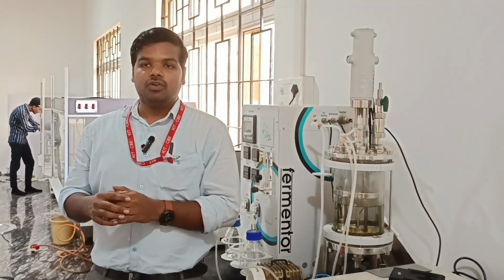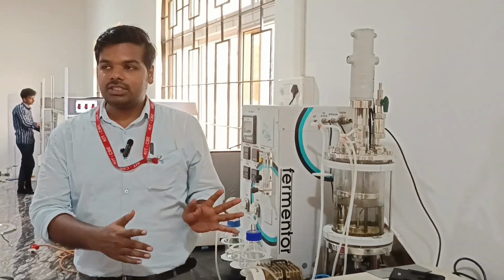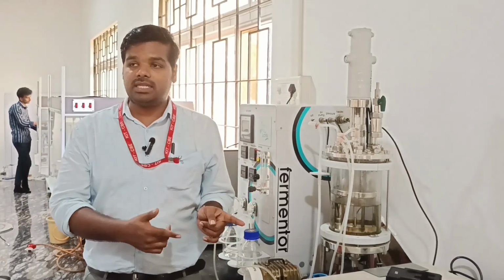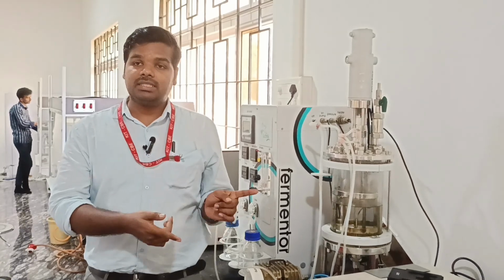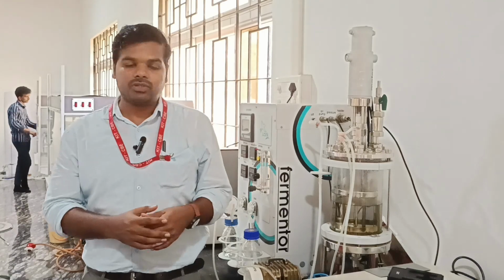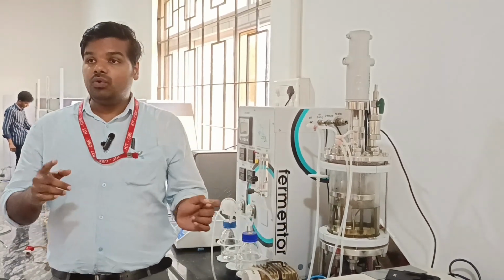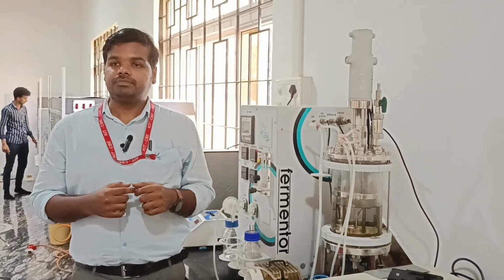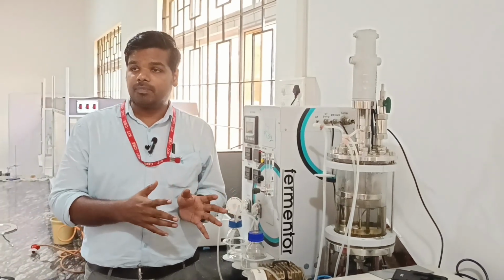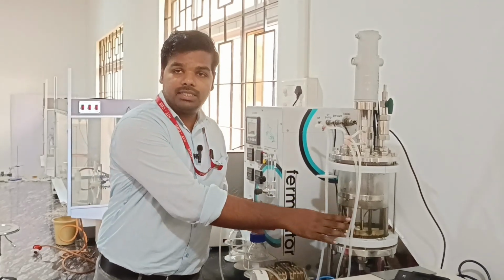We have a batch sterilization unit. The batch sterilization unit has in situ sterilization, meaning that the reactor itself consists of the sterilization part. We have a heating rod in order to heat the media that is present. For our experiment, we are simply using distilled water inside.